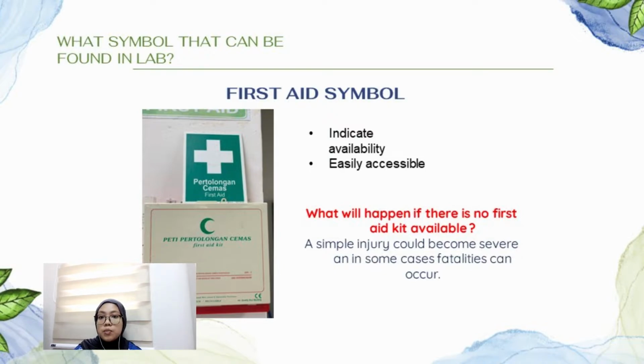The kit should be easily accessible to other locations that belong to a particular group. The first aid kit should contain the items recommended in the first aid kit policy and guideline for laboratories. It should be inspected monthly to ensure that no items are missing and that none of the remedies, including saline solution, ointment, and etc., in the kit have expired.